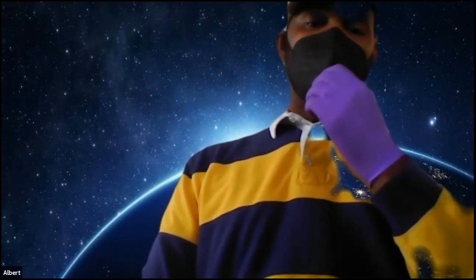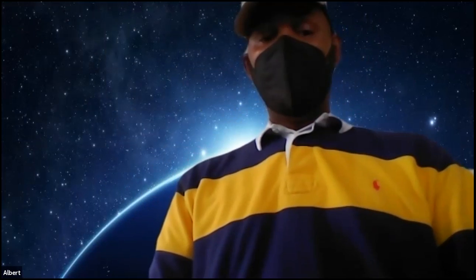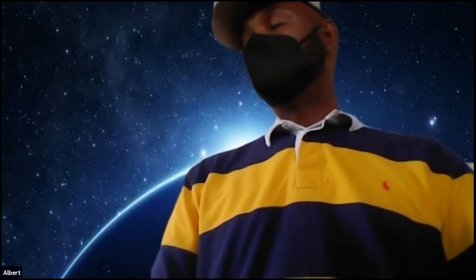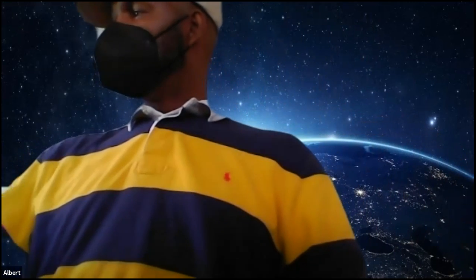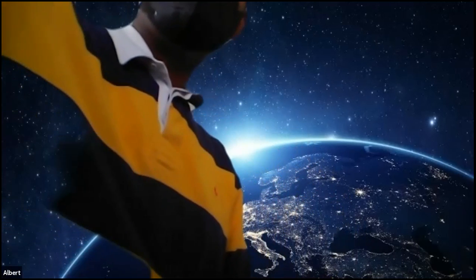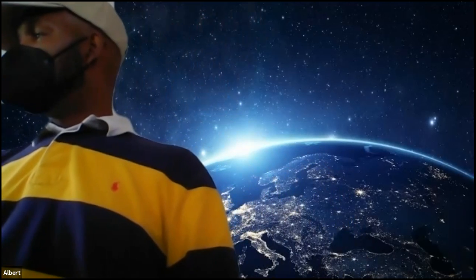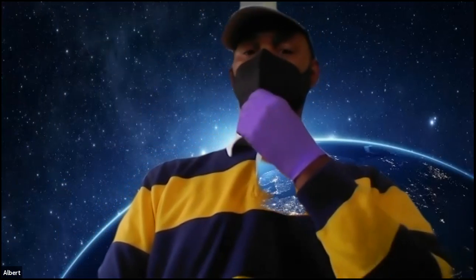All right, so everybody should write that value down somewhere, that we all began with 25 milliliters. That doesn't mean that it's going to take the whole 25 to dissolve the aspirin sample. That's really accurate. So go ahead and take that, put it in that 125 Erlenmeyer and start heating it up. Put that on a hot plate and turn the hot plate on somewhere between 1 and 2.